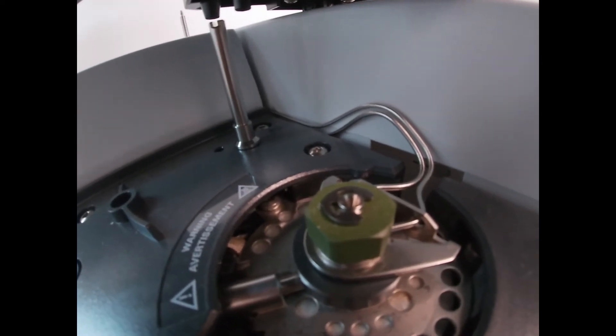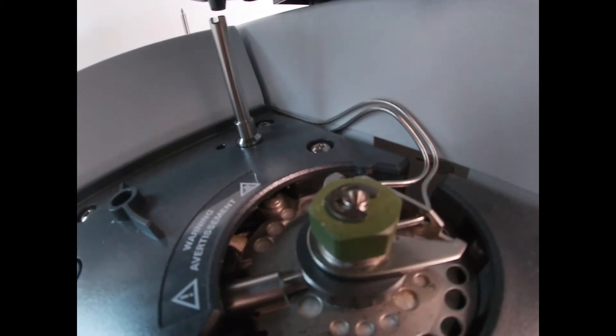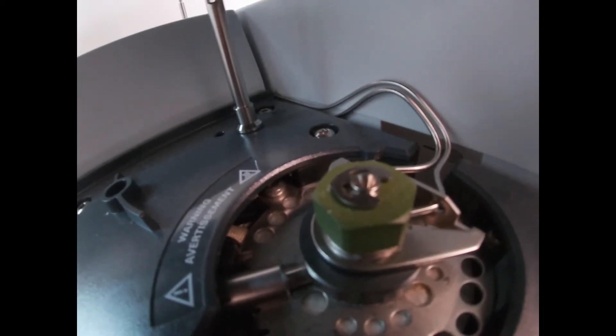It's typically heated well above the boiling point of any of the sample components so that they're instantly vaporized as they get injected onto the column. So they enter there, they get vaporized, they're mixed with the carrier.